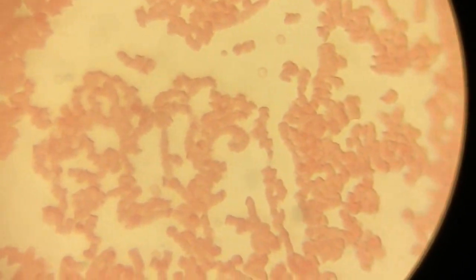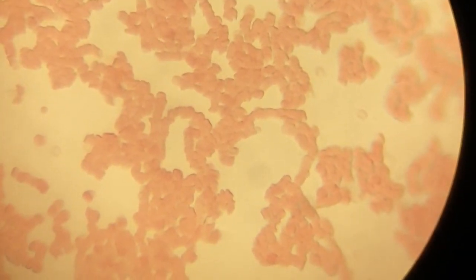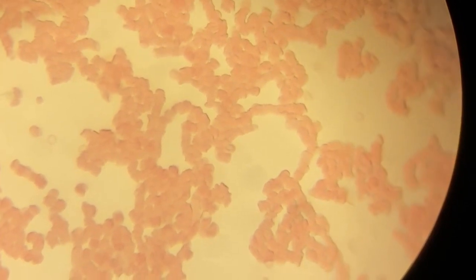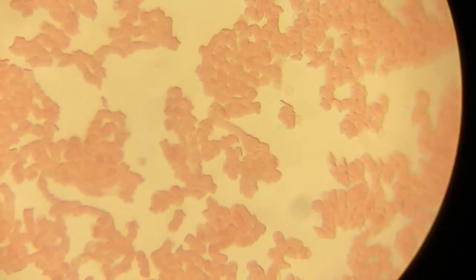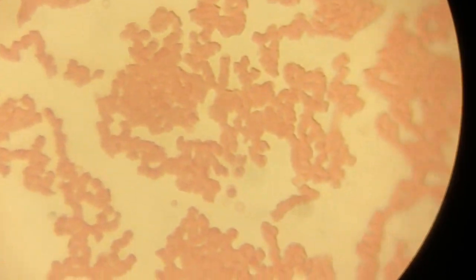I will explain what I usually do in my videos. I have a microscope, I take the first blood sample and show it to you guys. After that I eat or drink something — today we will eat honeycomb — I wait about one hour and take another blood sample again. You can see it on the screen; the blood condition changed dramatically, and in this video I will explain what happened and why.